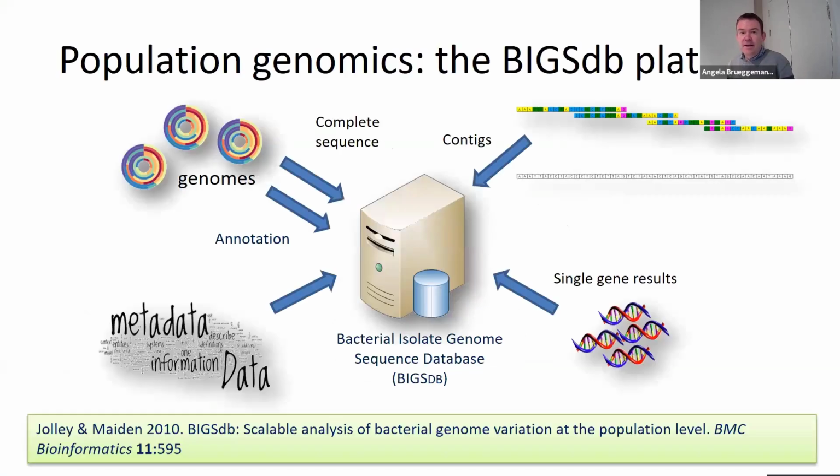Okay, so the BIGSdb platform stands for Bacterial Isolate Genome Sequence Database. It kind of does what it says on the tin, really. It's designed to bring together lots of different kinds of information so that they can be analyzed together. It derived from the earlier generations of MLST databases that we've been developing since the first MLST scheme back in '98. So there's over 20 years' worth of development in the ideas that we're presenting here.